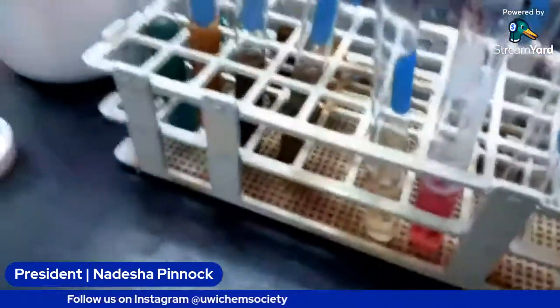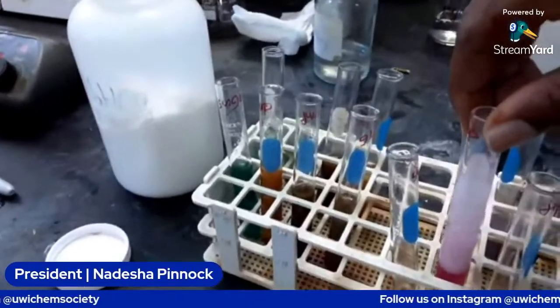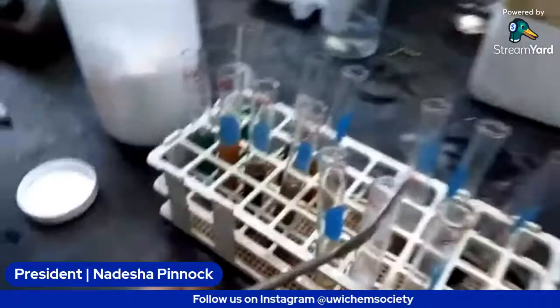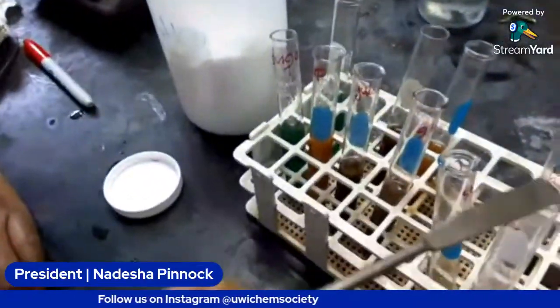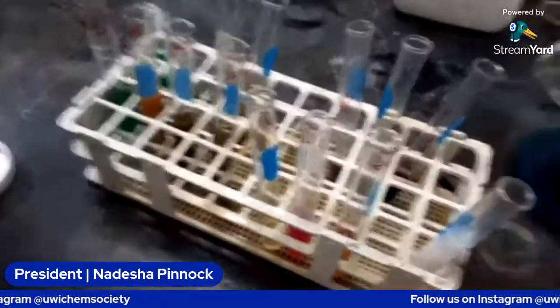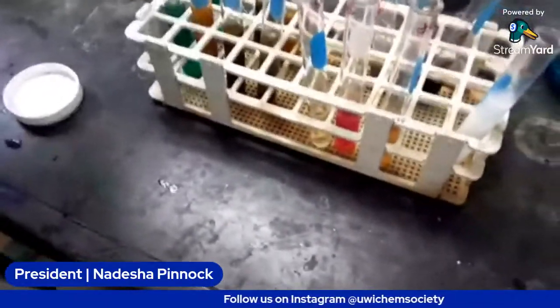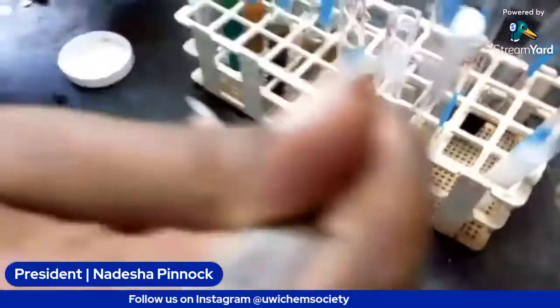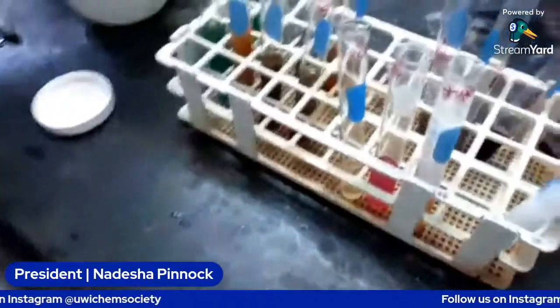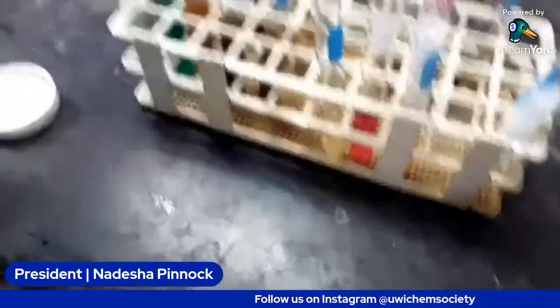Alright, this one not so bad. Alright, it will go over. Again, we measure the pH now. This one is the fruit juice. Not bad, shake it.